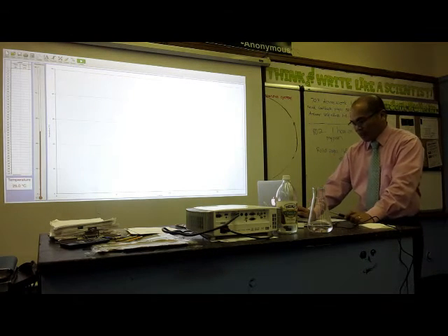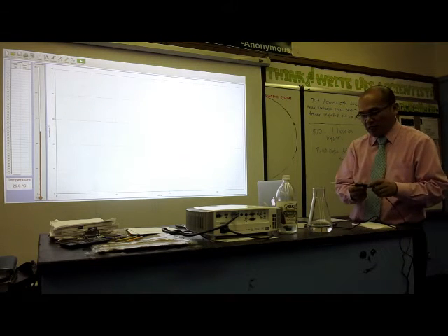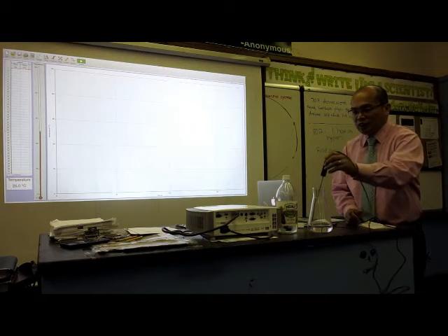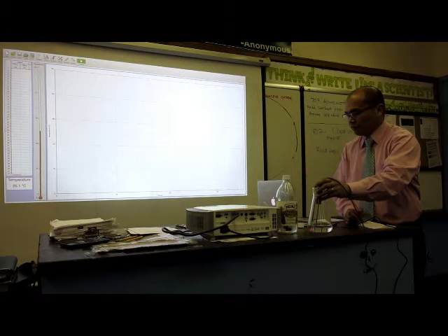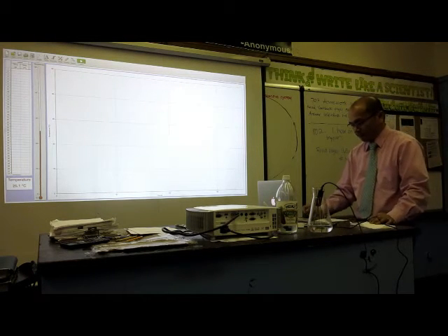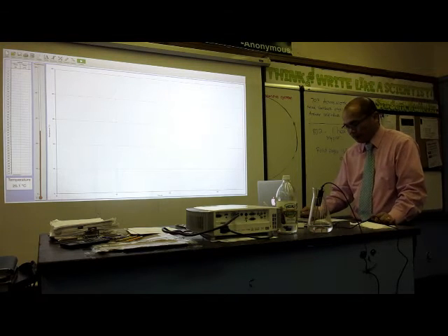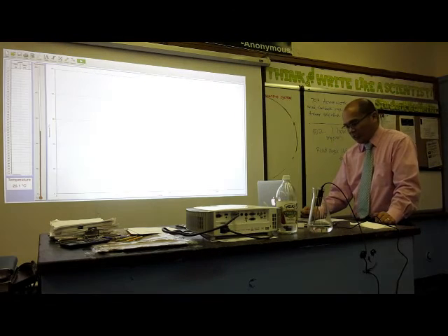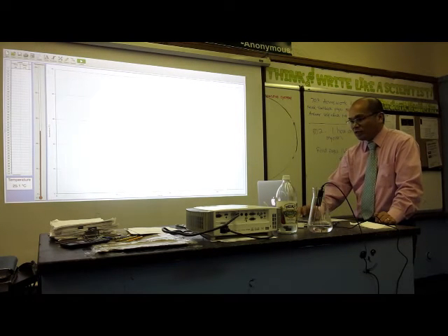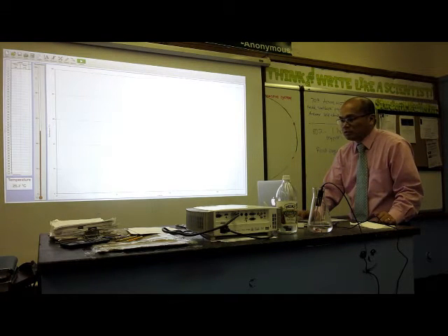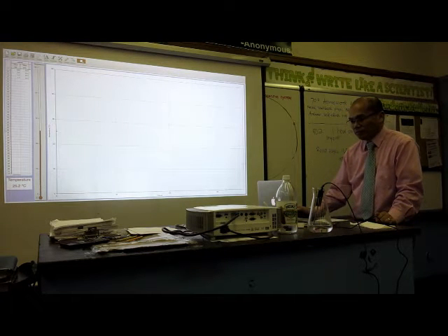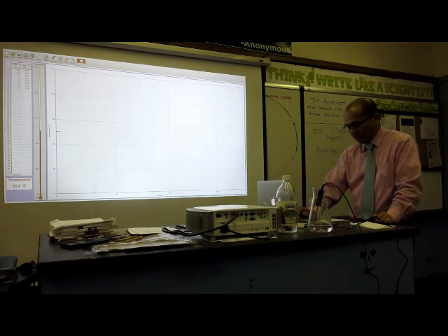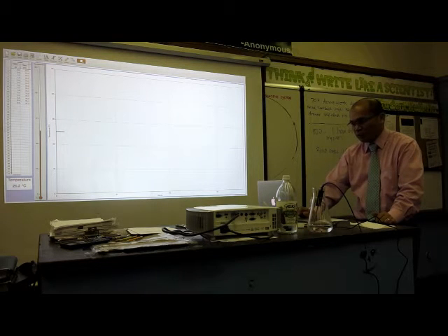Now place the GoTemp on the flask with vinegar for 20 seconds to obtain the initial temperature. Look at the computer screen and click collect to start data collection. Watch how the temperature of the probe changes.